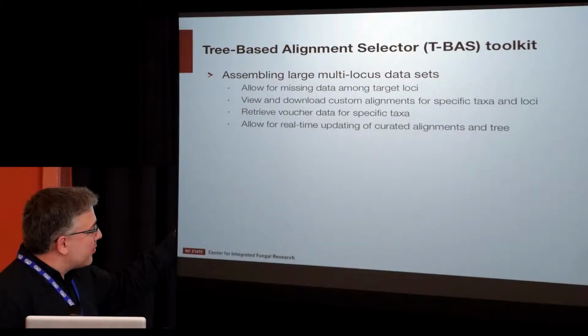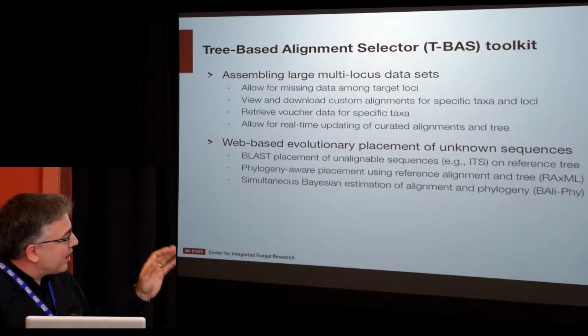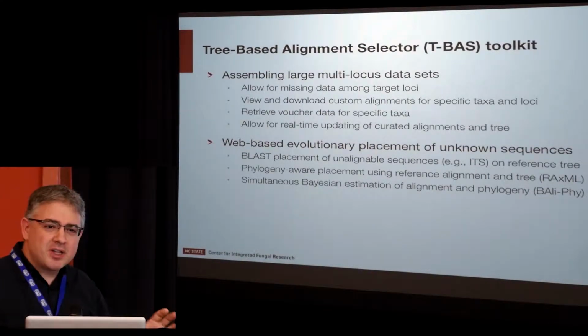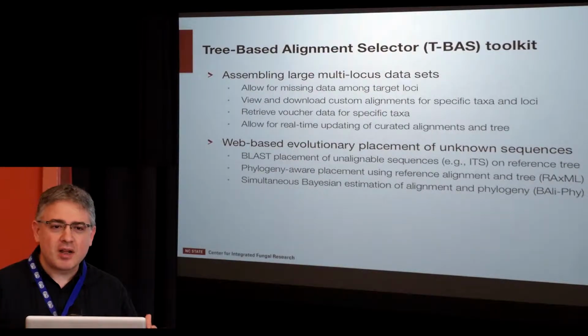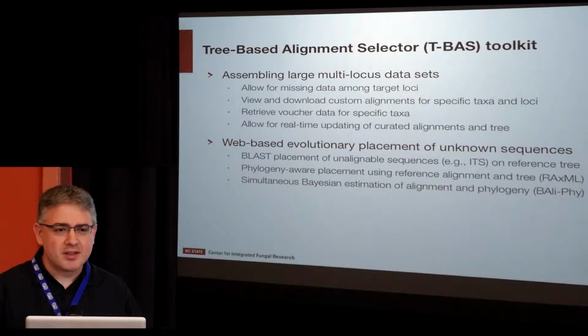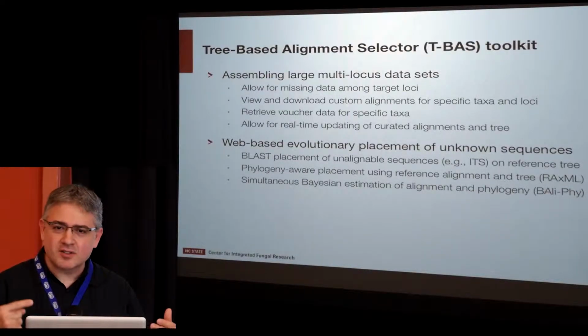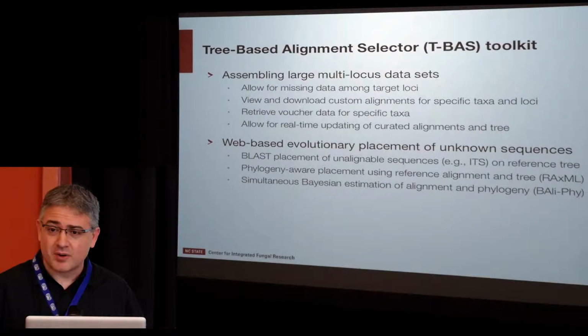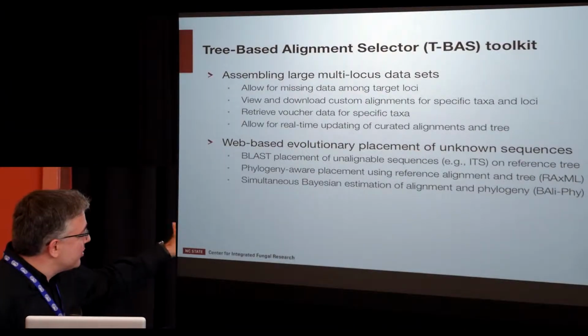So you need the real-time ability, but also important, these have to be web-based evolutionary resources. And the reason for that is, imagine building a standalone tool. You'll never have the resources to map thousands of metagenomic reads, and if you have 1,000 users online, that's also going to be a drain on a server. So you want to take advantage of distributed high-performance computing resources that are online. Makes sense? And that's what we want to really plug into. So it's important that we do this online.